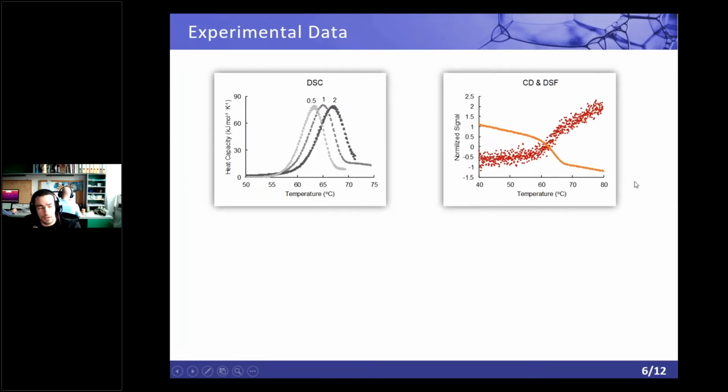Horizontally, we have the same x-axis, just temperature, but vertically we measure, for instance, a fluorescence signal. The idea is that in the transition region, you can see here in the middle, when the protein starts to unfold, it exposes residues to the environment that were buried before. So you see a difference in fluorescence or absorbance signal, or there are different spectroscopic techniques. But the type of data that people collect is very similar. And then again, they typically pick the middle point of transition.